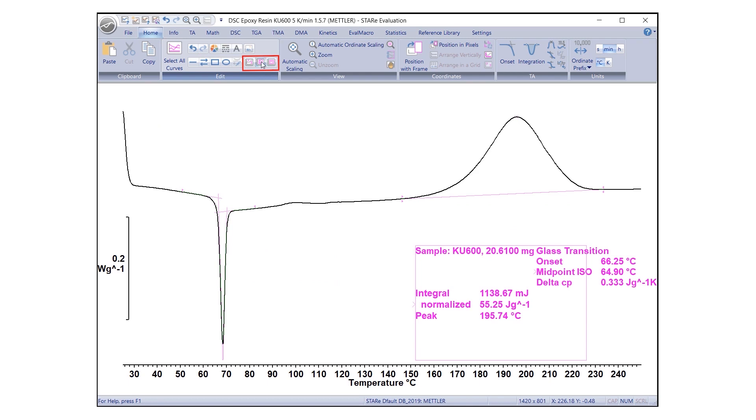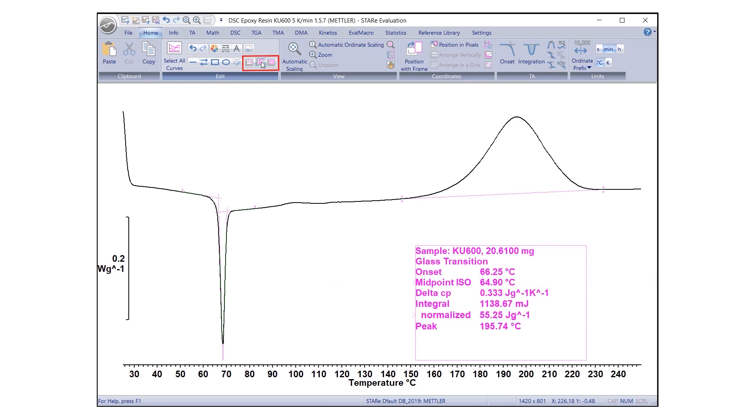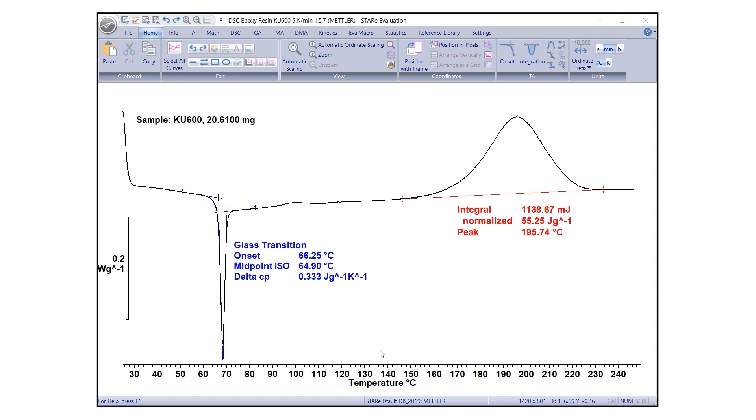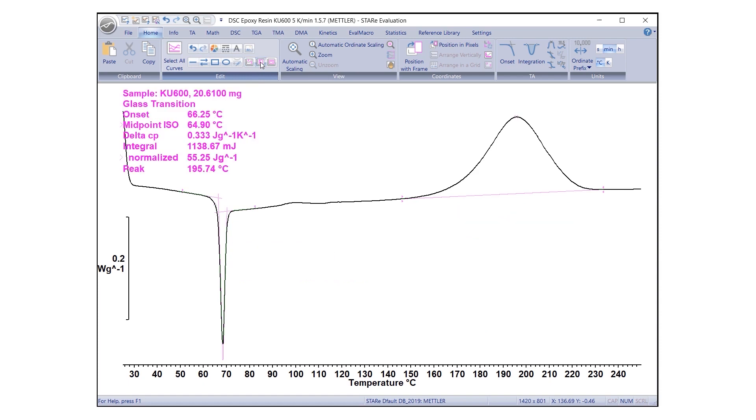To align all texts in the same way, click Select All Texts before clicking on either one of the alignment options. All texts in the evaluation are now aligned correctly. If the position for text is not specified by a frame, then the text will be aligned at the top or left of the evaluation.